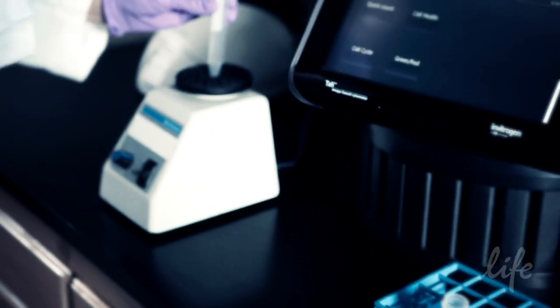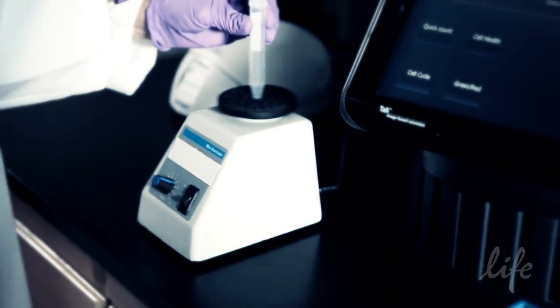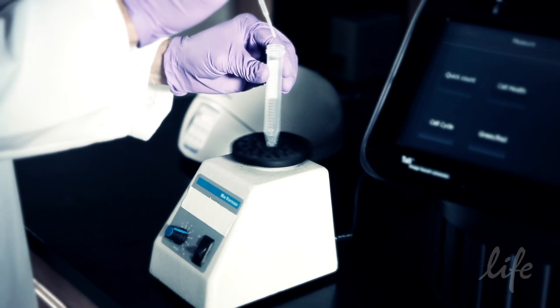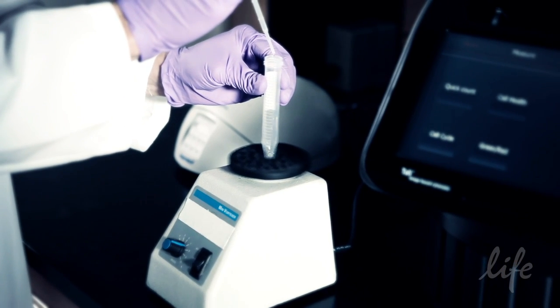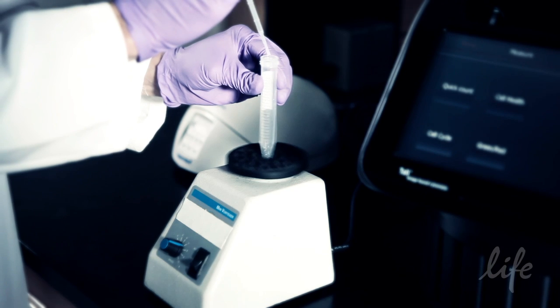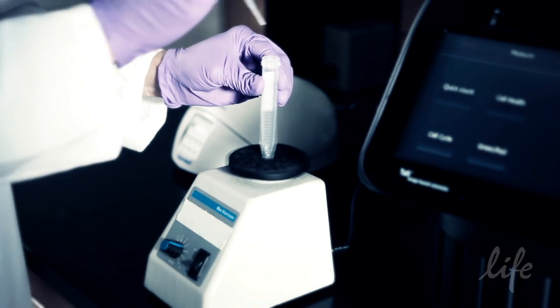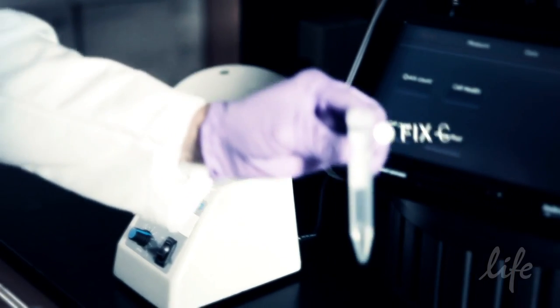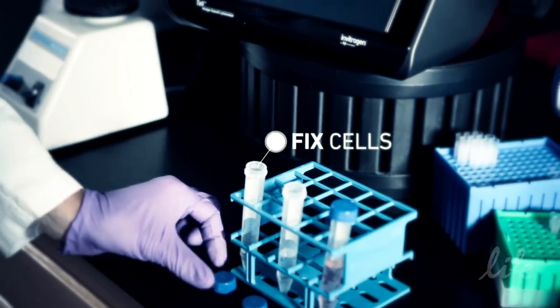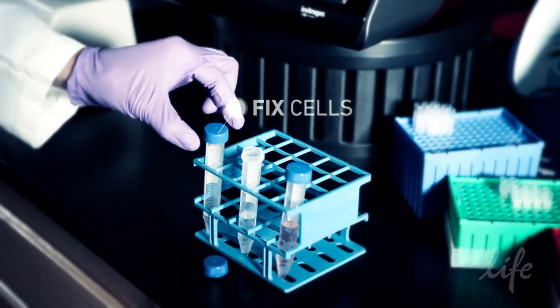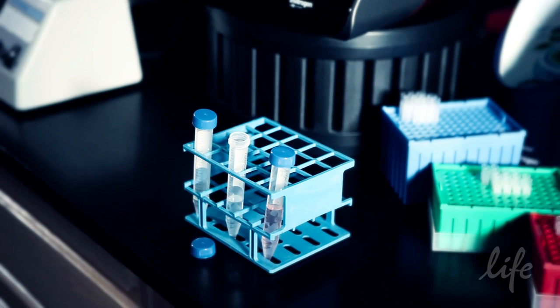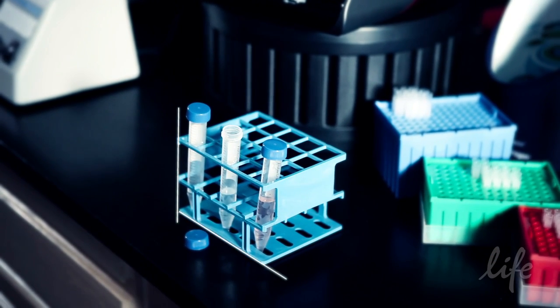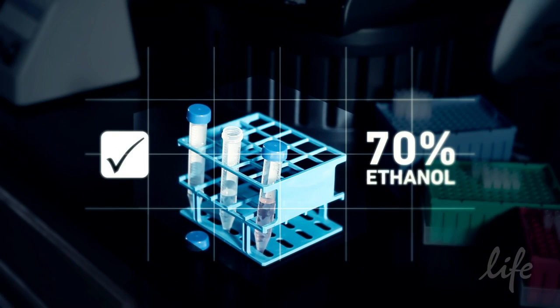To ensure single cell suspension of fixed cells, begin adding 70% ethanol very slowly, dropwise, while gently vortexing. It is very important that cells are fixed into a single cell suspension. Cells tend to clump during the fixation step. The very slow dropwise addition of the initial volume of 70% ethanol, first 1 milliliter, while gently vortexing, will help prevent cells from clumping.